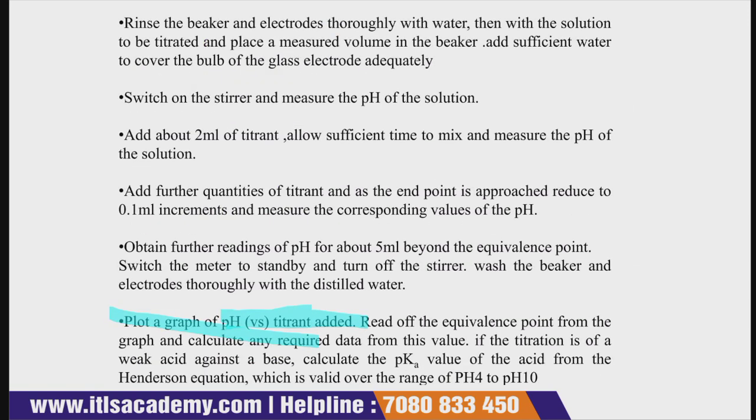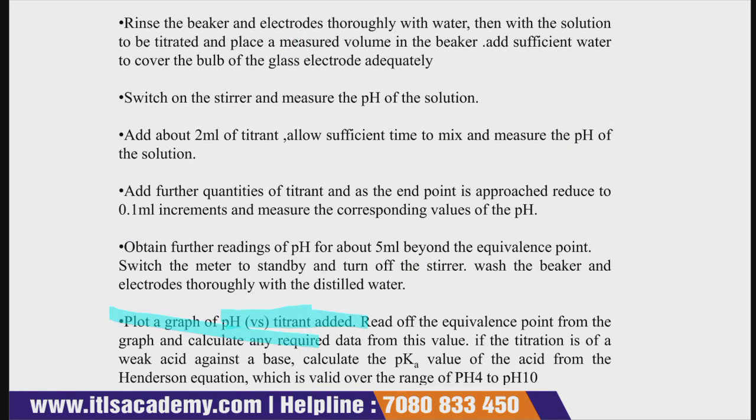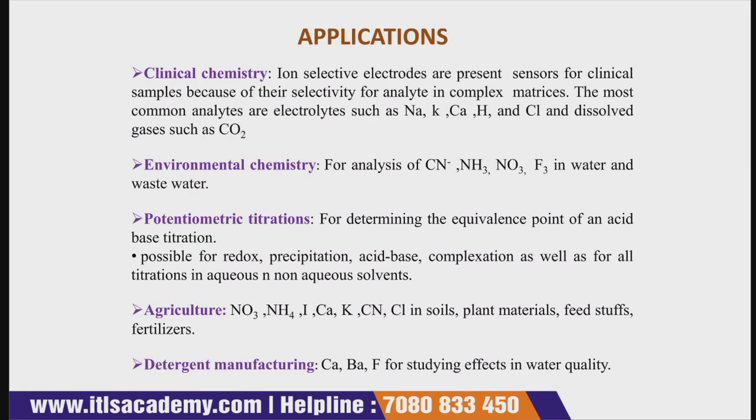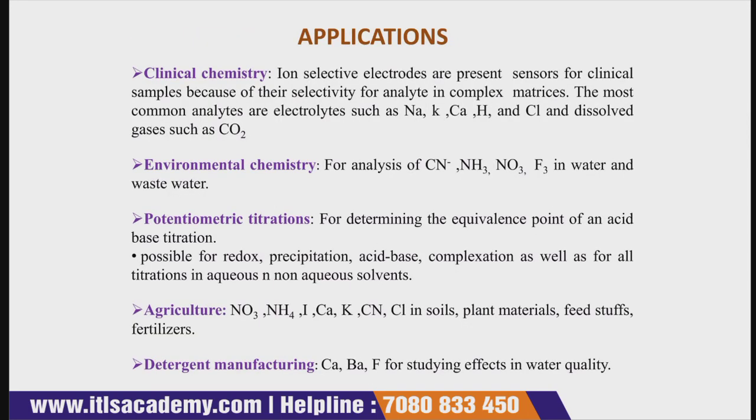Okay, so this is the working of potentiometry. It means how potentiometry basically works. Now let us discuss some important applications, students. If you see the application part, potentiometry has a huge application in clinical chemistry, in environmental chemistry, in potentiometric titration, in agriculture, and in detergent manufacturing.